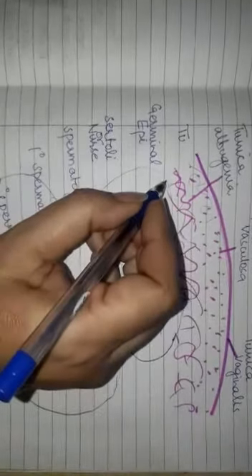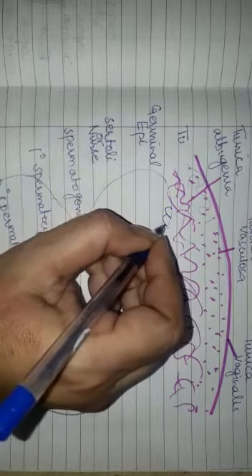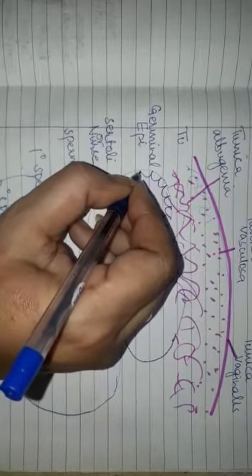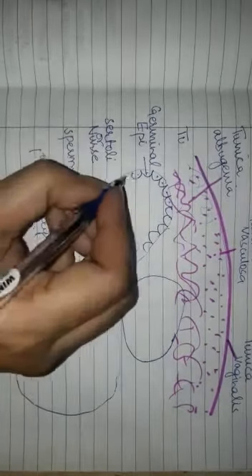अगर हमने एक सेमिनिफेरस ट्यूब्यूल को देखें तो it is lined by cuboidal epithelial cells, and these cuboidal epithelial cells, they form a layer. This is called germinal epithelium.